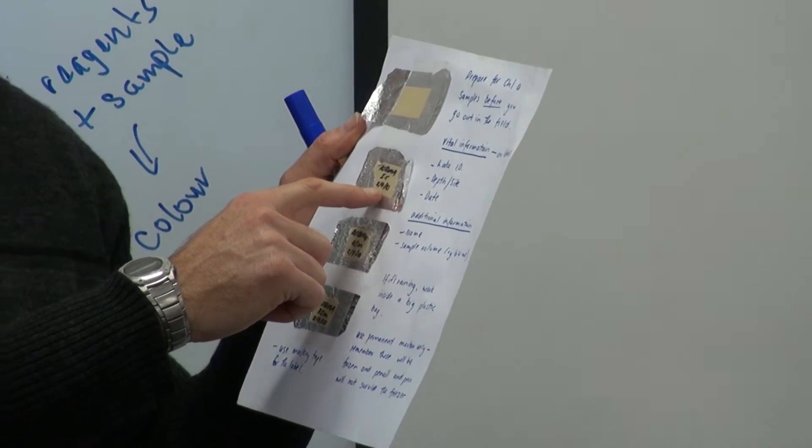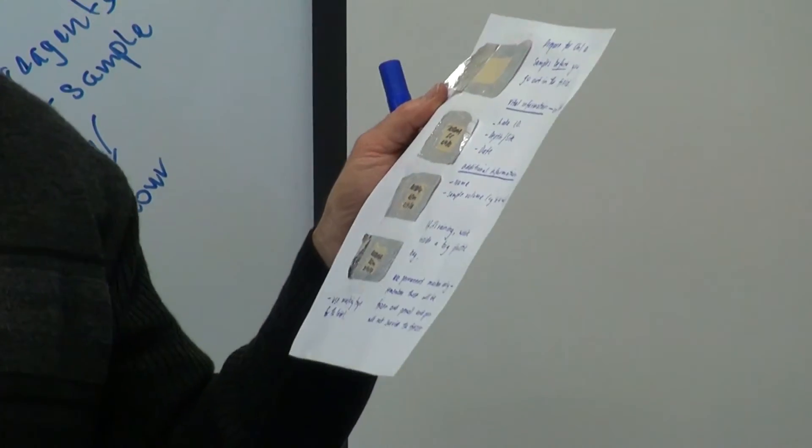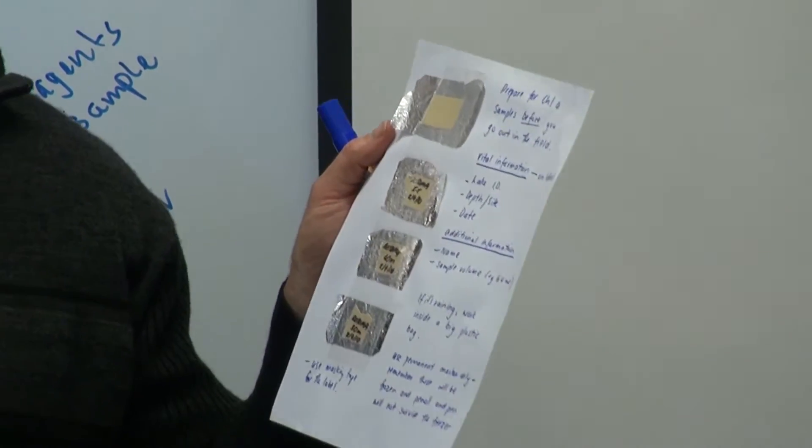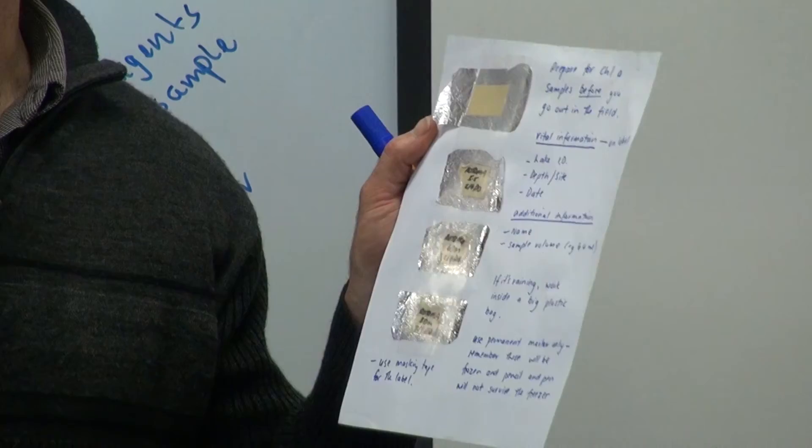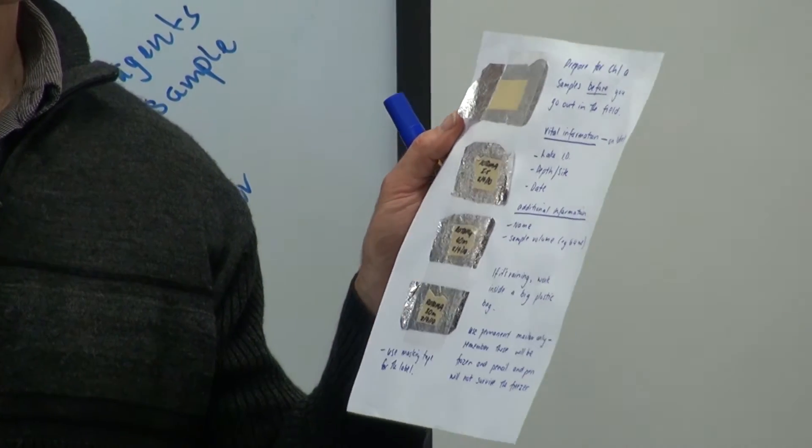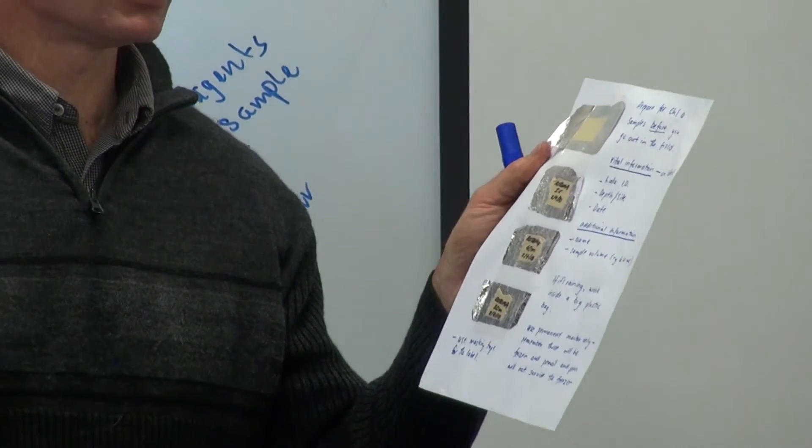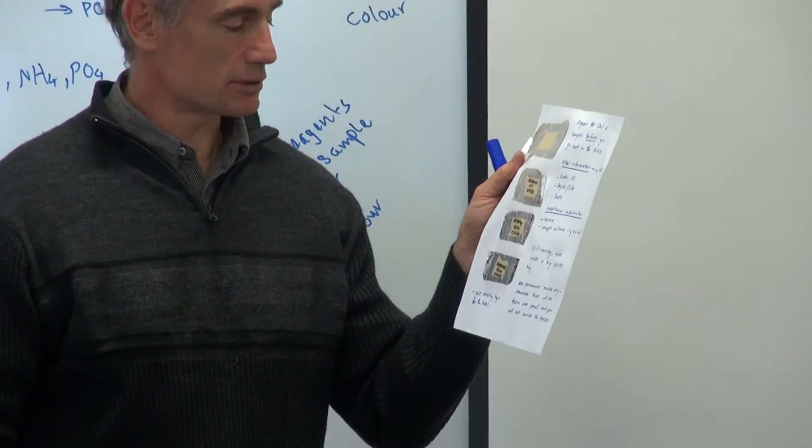And she's actually missing a really key part, which is the volume filtered. Absolutely essential that you have the volume filtered, because otherwise you might not be able to calculate your concentrations of chlorophyll.